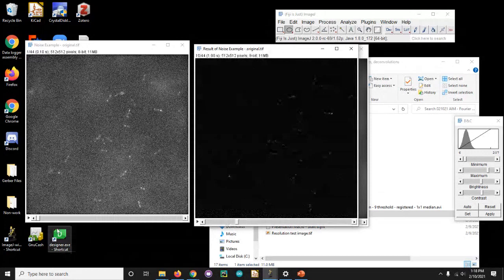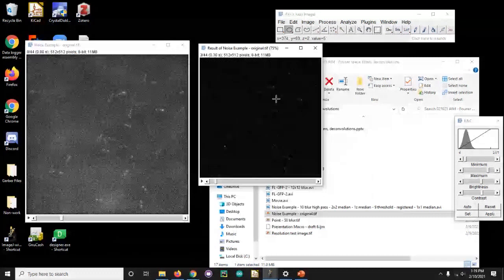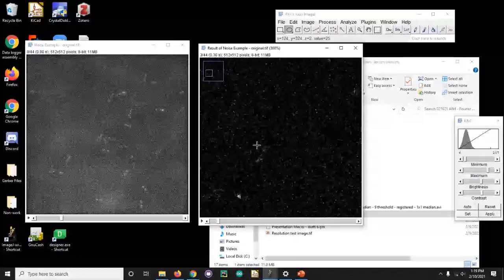So the next thing we can look at is the next noise I'm seeing: this salt and pepper noise. This is very, very high frequency, single pixel. And my bacteria aren't single pixel, they're at least a few pixels in size. So now I can play the opposite, which is, I have these outlier pixels. In that case, that's a classic median. I don't want to spread out these bright points. I want these overly bright points to become the value of their neighbors.